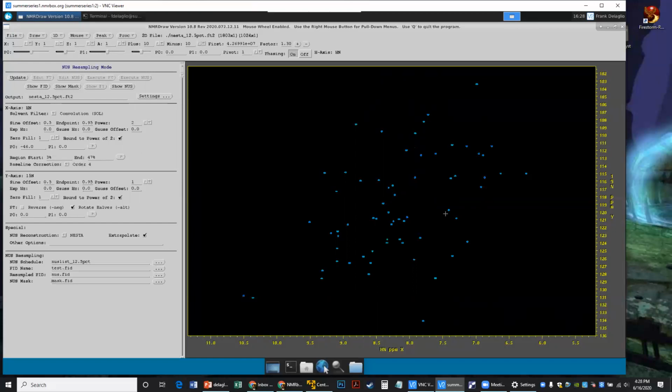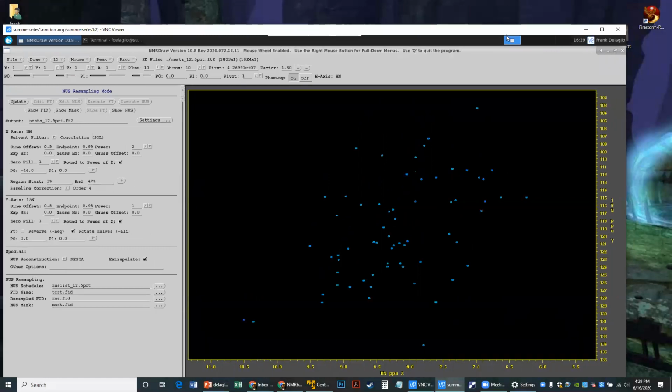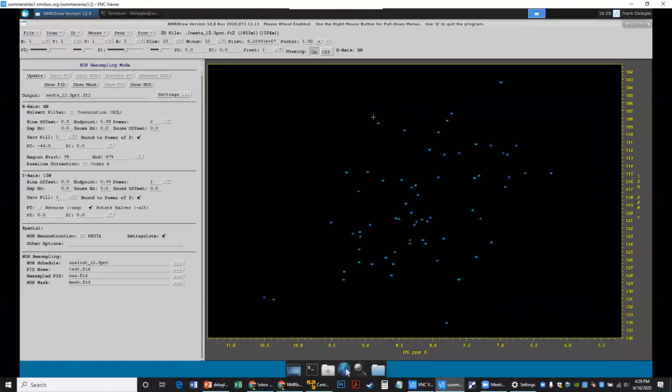So for a particular class of molecule, when you have an idea ahead of time what the most complicated molecule is that you are likely to see, and you're not sample limited, so you don't think that signal to noise is going to be an issue, for all of these routine measurements, you can do this pretty safely in a standard way, and all of the reconstruction methods give nice results. Okay, so that is the 2D case.